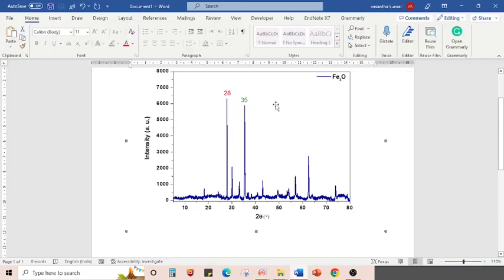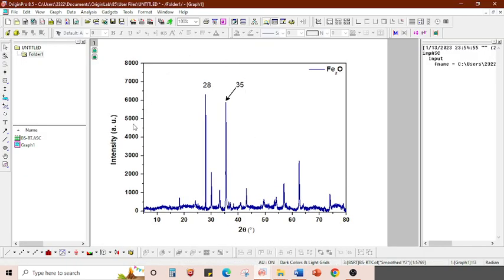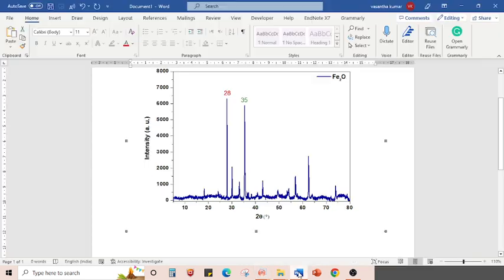and the changes are saved here in the Word file. And this origin is not saved. Whereas our previous origin file still remains intact. You see, there were no changes imparted here, but this has gotten changes imparted. So this is the advantage of copying the page and pasting it.